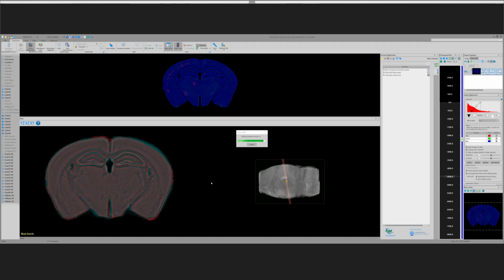So what I can do now that they've been registered, it's still registering. I think it's just the last section finishing up. What Brian's referring to is that this program does enable you to pull up the different anatomic regions.